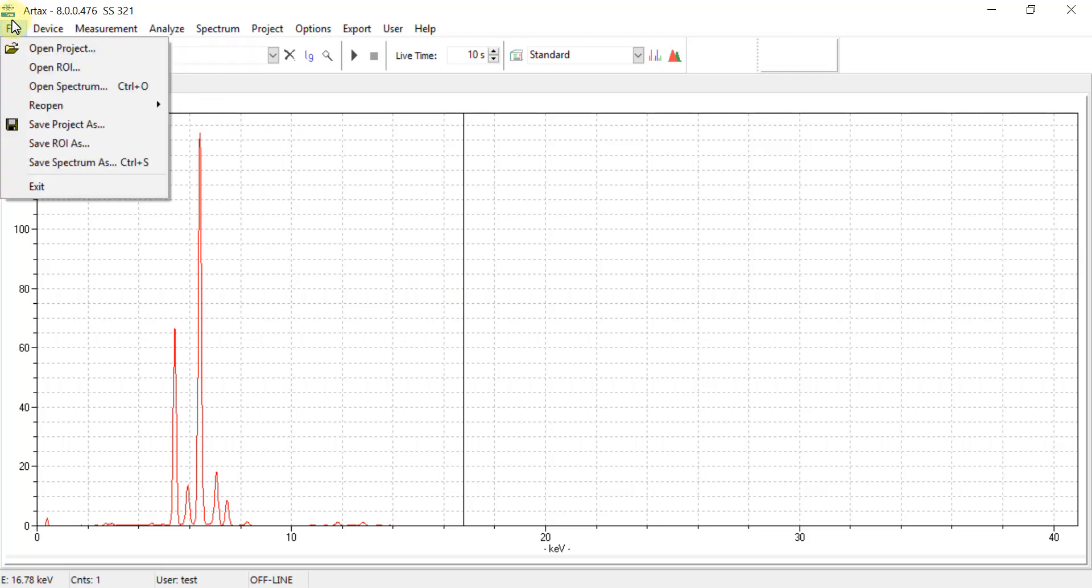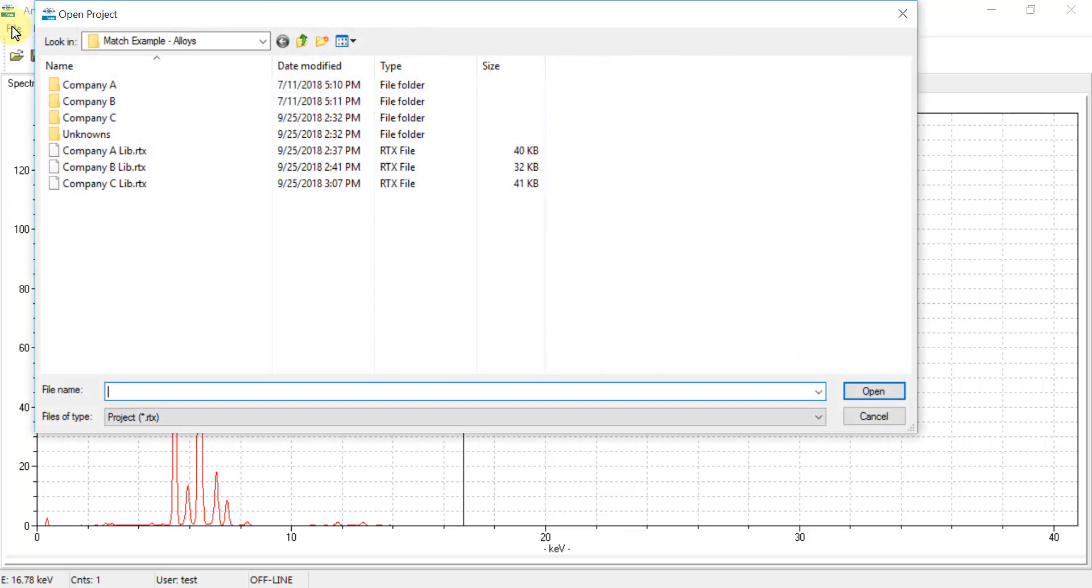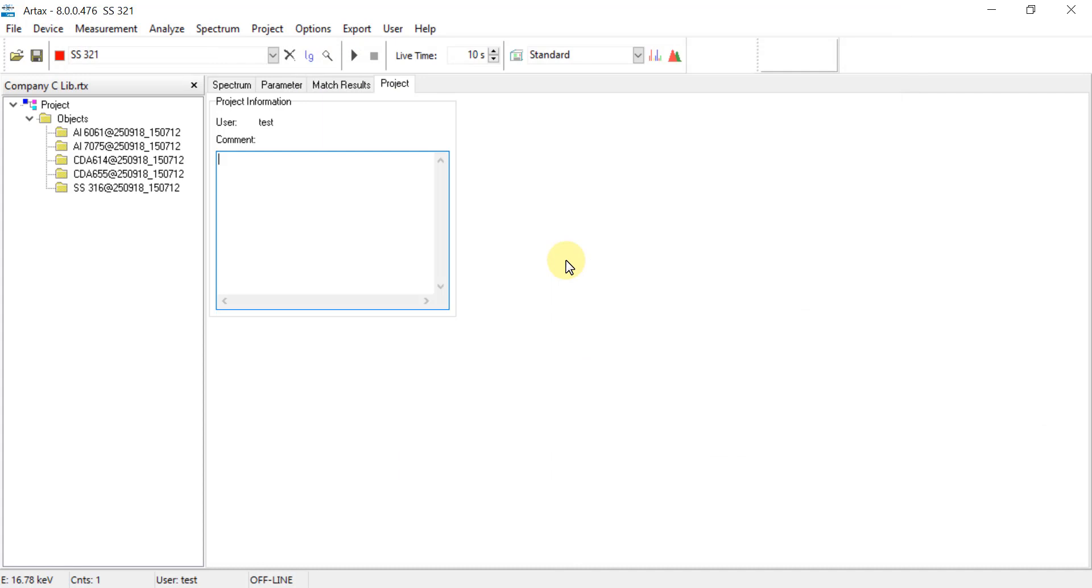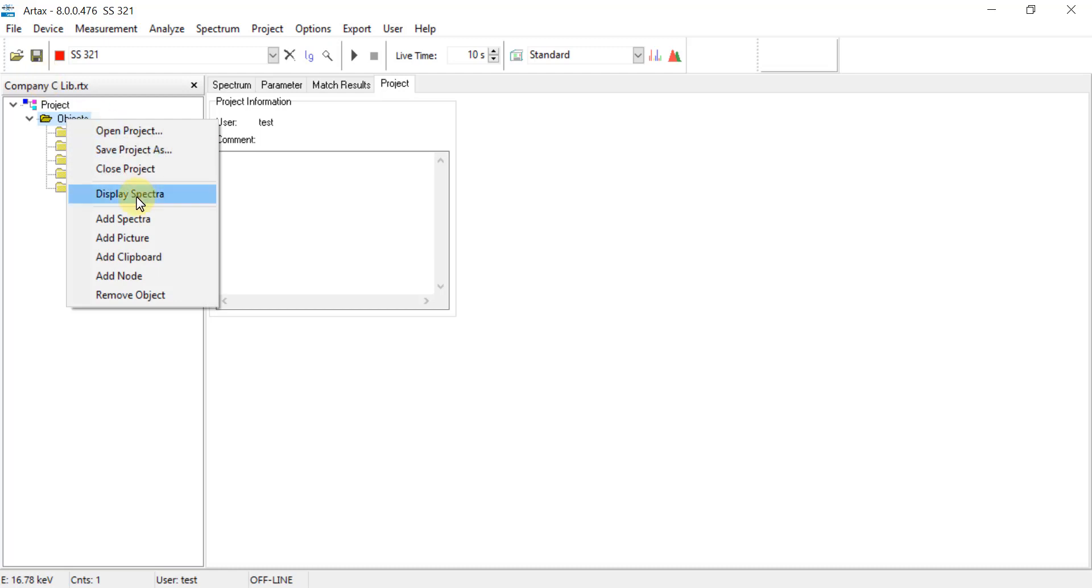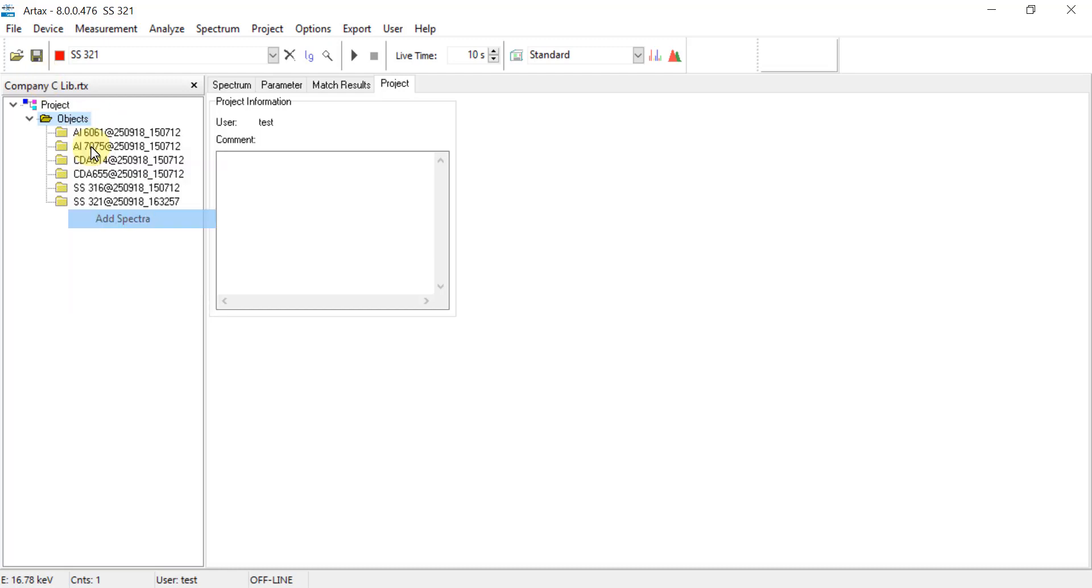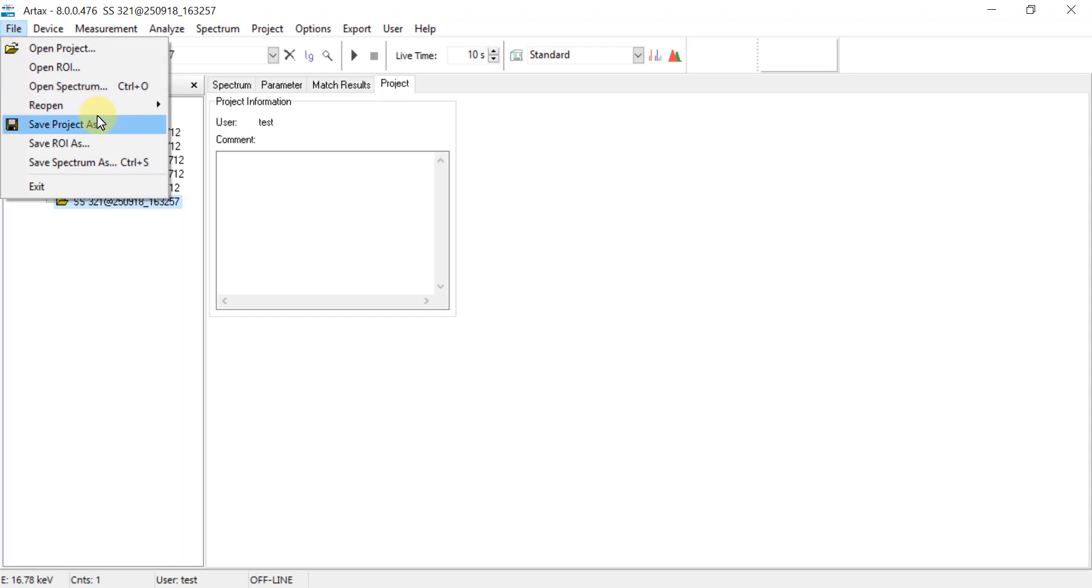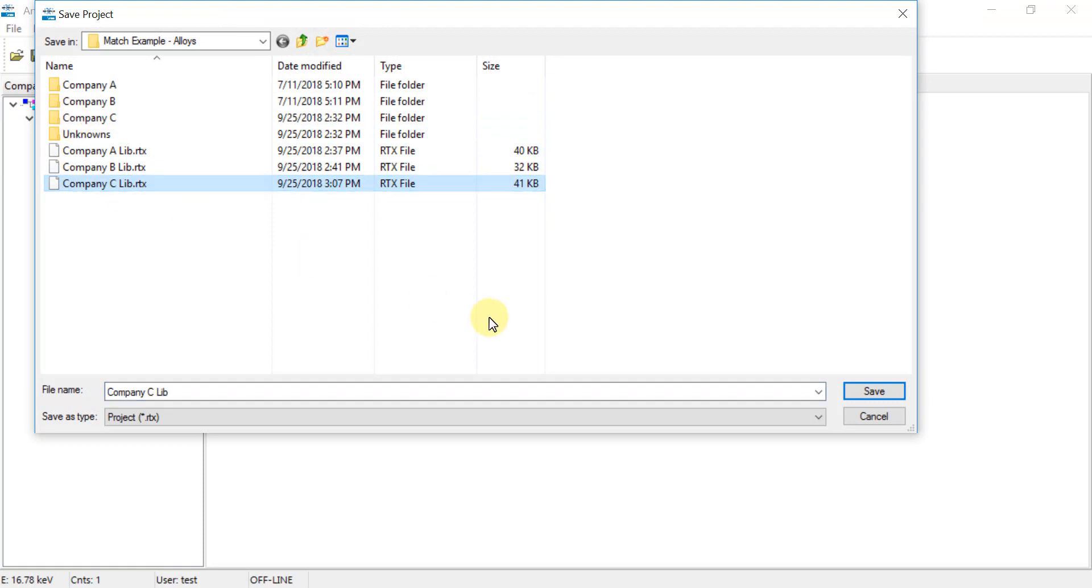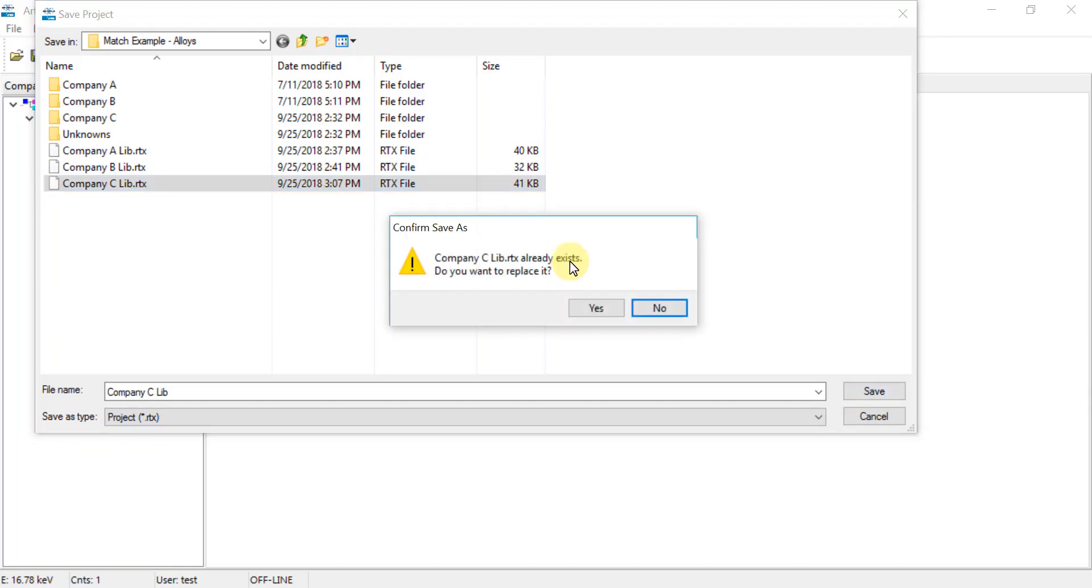Then go to File, Open Project, and then select the library file that you would like to add this to. In the Objects folder, right click and Add Spectra, and now you can see that stainless steel 321 has been added to this list. Then go to File, Save Project As, and then just overwrite the existing project file, and now that PDZ file is included.